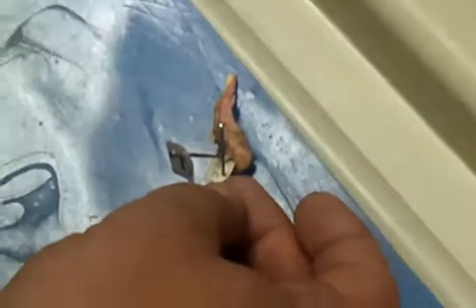Okay? All right. C, I hope you could see that. It was small. I probably should have done it on a bigger brain, but I figured optic chiasm. Okay. And if you are able to lift that up, you could probably see. Now, the hardest one I thought for the whole test, this part has like 3 different subdivisions.